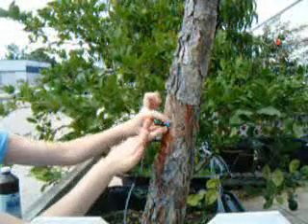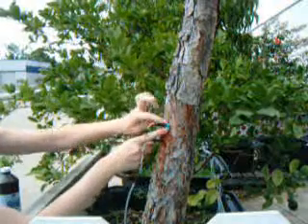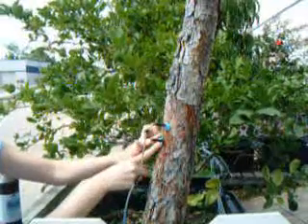Install plastic putty or pruning wax sealer around the needles to surround them with a waterproofing seal. This will prevent water from touching the needle shaft, which would cause a heat sink effect or large temperature gradients.